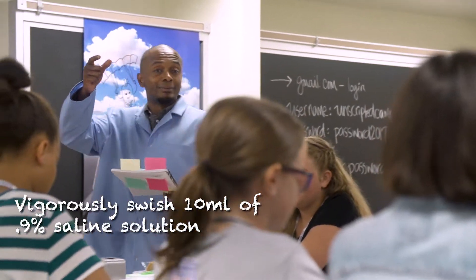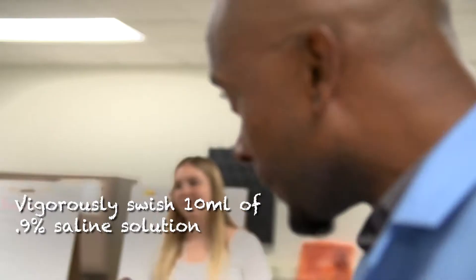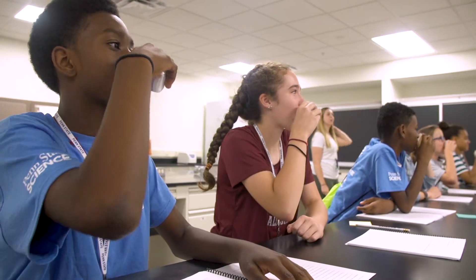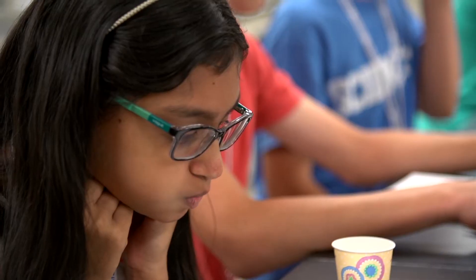We had to put the salt water in our mouth and swish really vigorously to get cheek cells. Everybody take that cup, and then we're going to go for 60 seconds. One, two, three — vigorously swish. It was really hard because we were all laughing a lot.